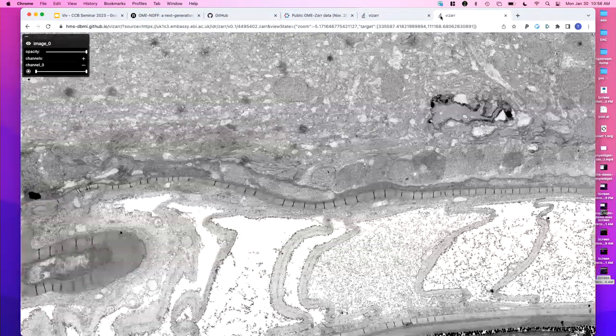So I think this is a very minimal example of that, but that's something that we're generally trying to apply to these other tools, to allow this linking of, oh, I saw this, and you can just share that with someone. So yeah, I think that would be super helpful.